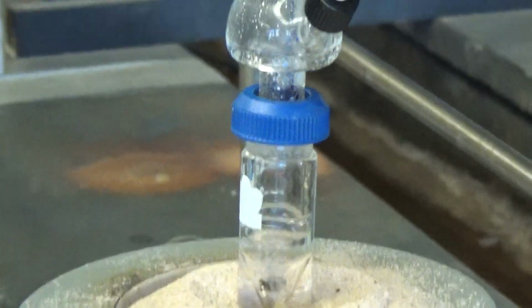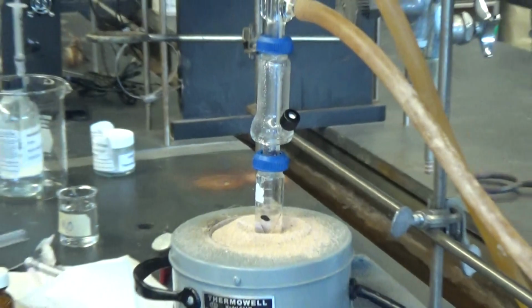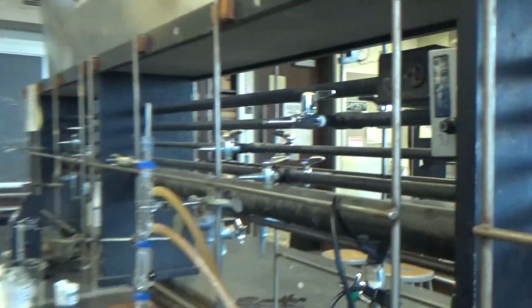So we're gonna stop it. Let me get the final temperature one more time. 100 degrees Celsius. Sorry, let me look for it. There it is. We're stopping at 100. We waited a couple minutes, and I think we're ready. We have a lot of product. Let's stop it. First thing to do is to turn off the switch here, then unplug. And you unplug here. Okay, so 3 steps.